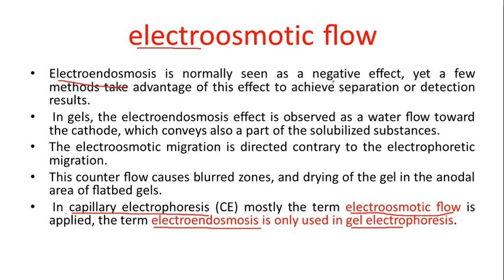Electroendosmosis is normally seen as a negative effect, yet a few methods take advantage of this effect to achieve separation or detection of results. So please keep in mind, it creates negative effects.